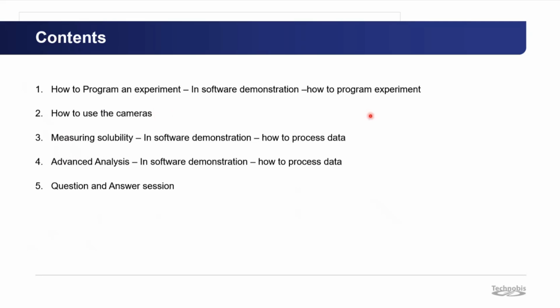Next will be measuring solubility. This will be done through an in-software demonstration, showing you how to process data that you have collected on your Crystalline in order to get solubility and metastable zone information. Fourth will be advanced analysis. This will be an in-software demonstration, as well as some slides, on how to process data in order to get particle size and shape information. And then ending on the question and answer session.